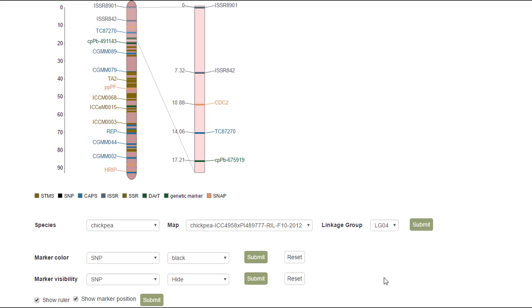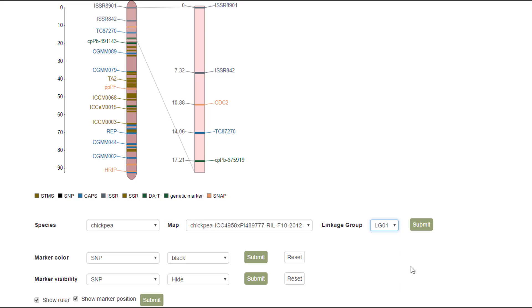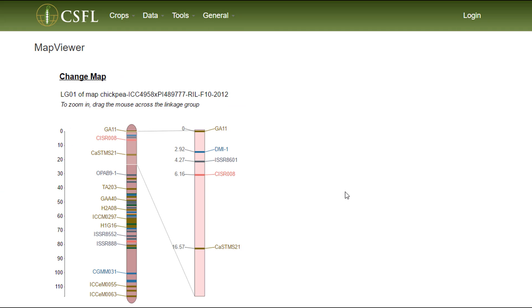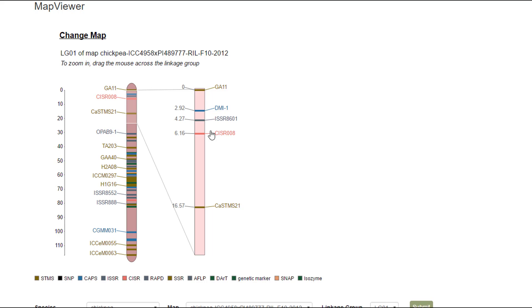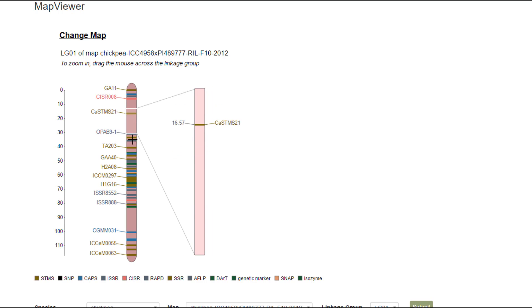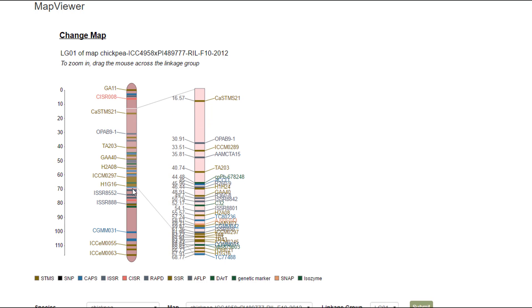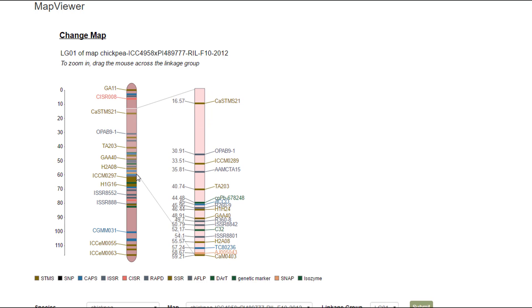If you'd like to view a different linkage group, just select the linkage group in the control panel and hit submit. And then you'll be able to explore this linkage group.